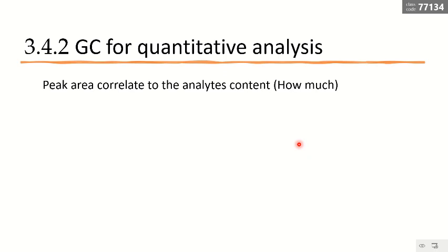If we are going to do quantitative analysis, basically how much, I know what this compound is, but I don't know how much is inside, then how do we do it? Then we are going to use the peak area. You still remember the previous slides where we talked about the peak area, right? The peak area will correlate to this content.